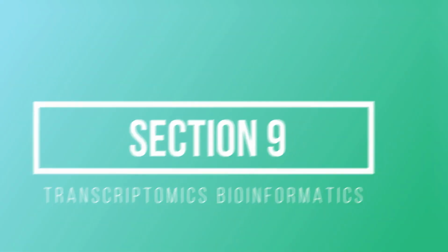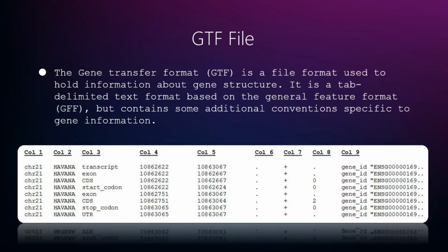So in the last lecture, we were using the sequences file, the FASTQ file, and the file of the genome that we are using to align the reads. Now we want to extract the annotations of that file. We want to extract the features from that file.